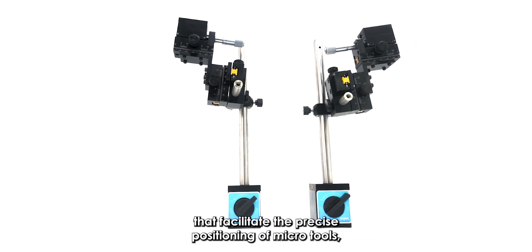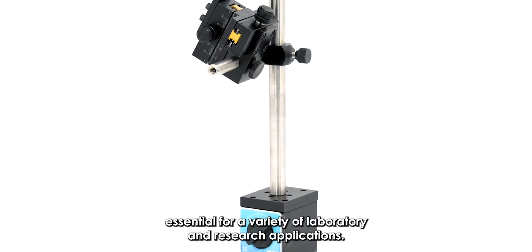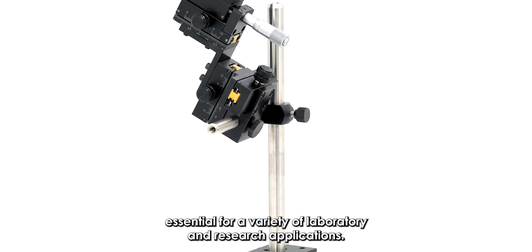Holmark's micro manipulators are expertly designed devices that facilitate the precise positioning of micro tools essential for a variety of laboratory and research applications.